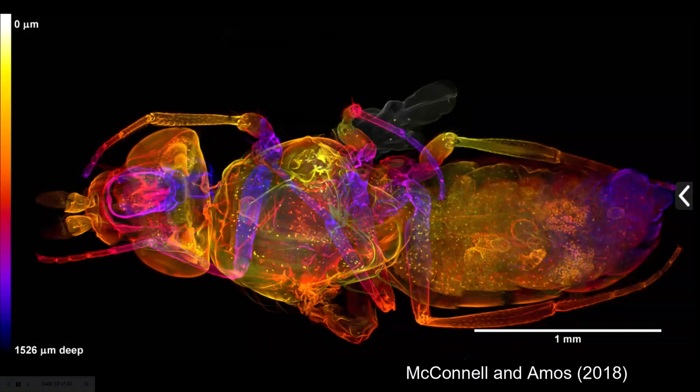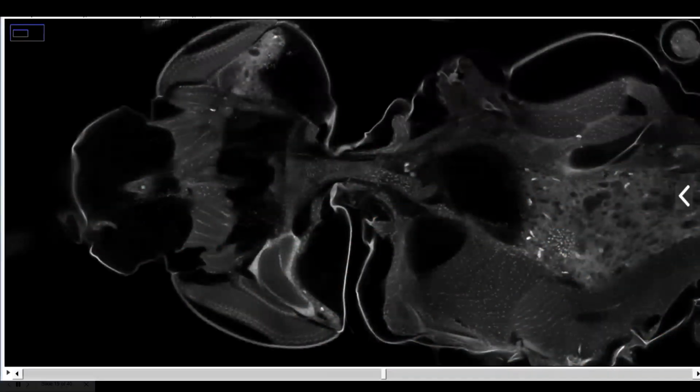We've developed methods for preparation of specimens specifically for imaging with the Mesolens, but also now with other technologies, including larger stitching and tiling light sheet imaging systems. They include fixing and clearing whole adult Drosophila. This is a female fly, but I don't really like these data because while it looks quite nice, you don't see anything. Let's go to the raw data.